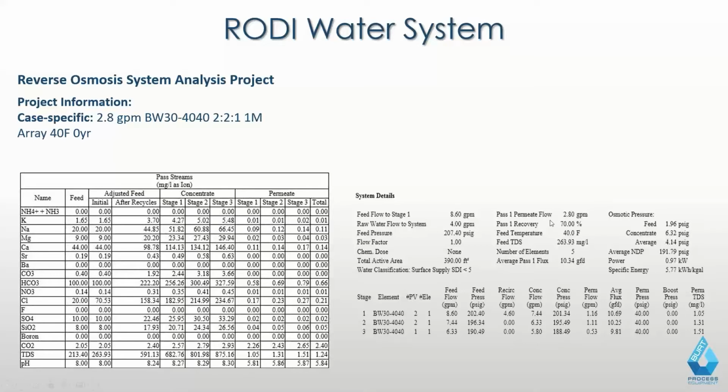As you can see here, the feed temp is set at 40 degrees Fahrenheit. I live in the northeastern U.S., and that could be kind of what our water is, definitely in the middle of the winter. And that gives you an excellent permeate rate from a treatment standpoint. It does, however, require increased pressure. And that's really what you're doing in these kinds of projections. You're modifying pressures and temperatures, and you're seeing what your different permeate rates come out to actually do your treatment.